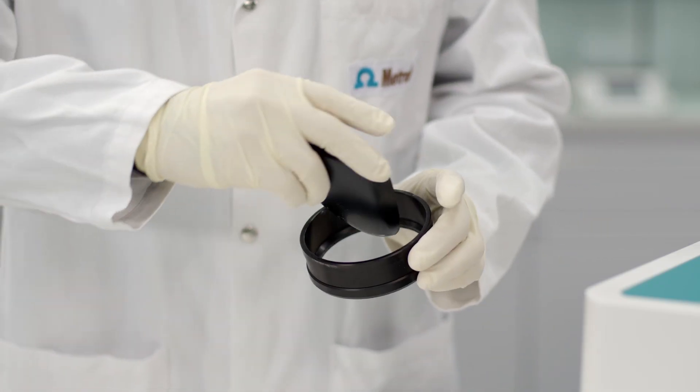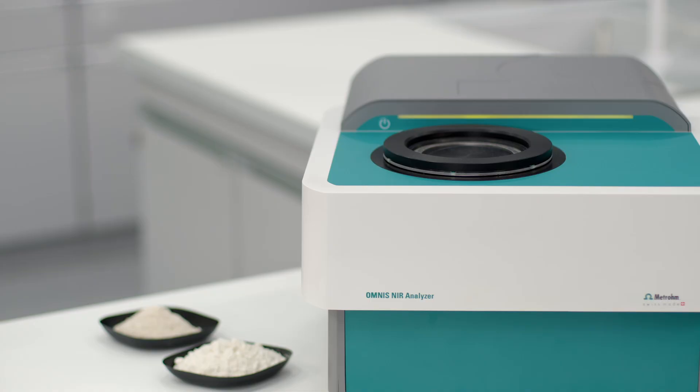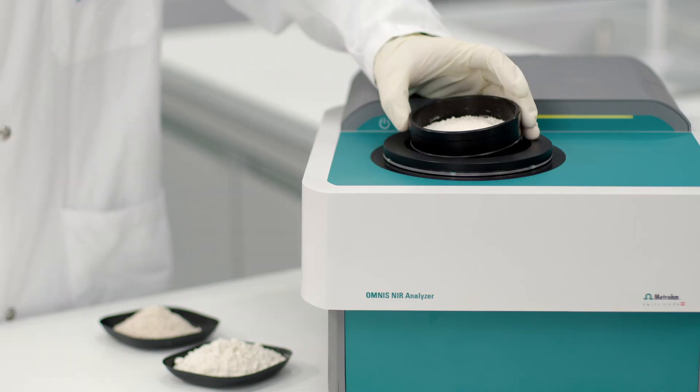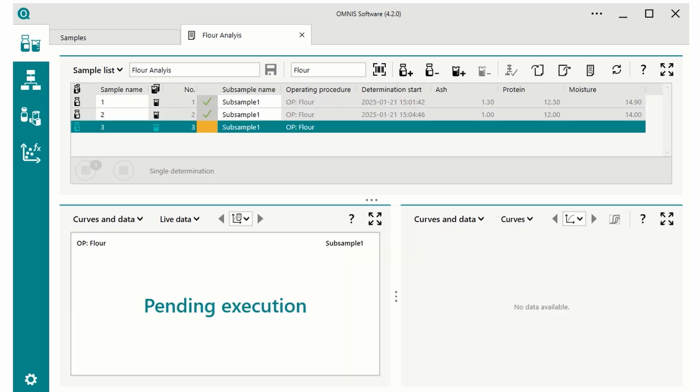This is how it's done. Simply fill the cup with flour, place it on the Omnis near analyzer solid and press the start button in the Omnis software.